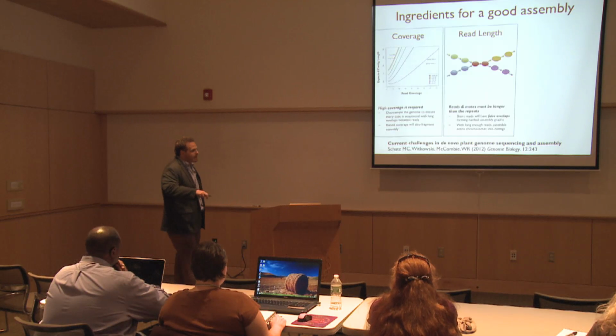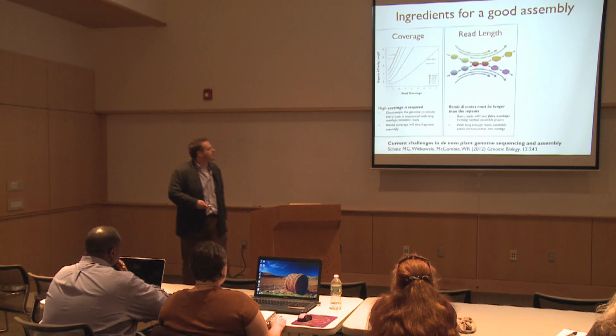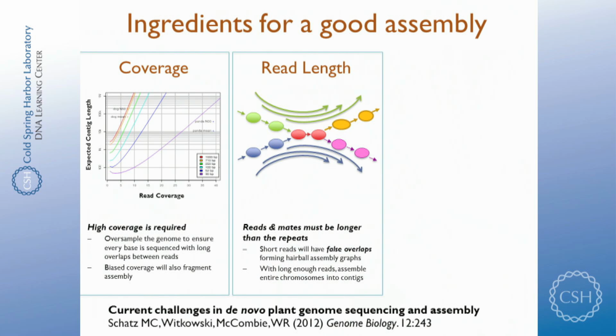But if we can overlay that information using mate pairs or longer reads, we can say, aha, these contigs came from chromosome 1 or some chromosome. These contigs came from some other chromosome. Let's separate them out. Let's resolve across those repetitive elements. Again, it's all relative. The lengths that you need for microbes are very different from what you need for mammals or pine trees, just because those larger genomes tend to have much more complicated structure.